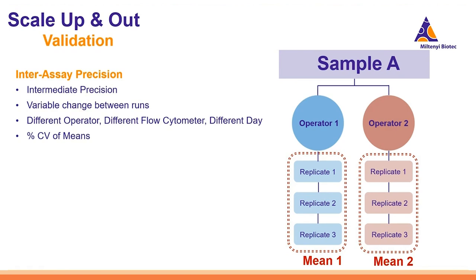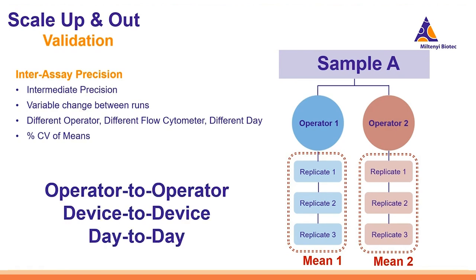And with this, you can change a number of variables, but I recommend things like operator to operator, device to device, and day to day as the variables that you change.